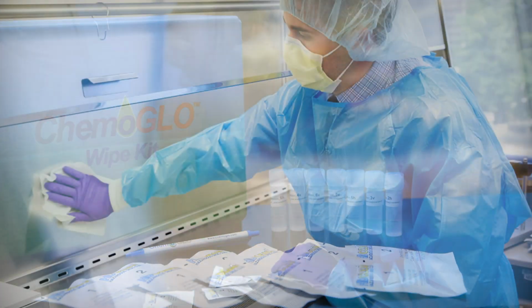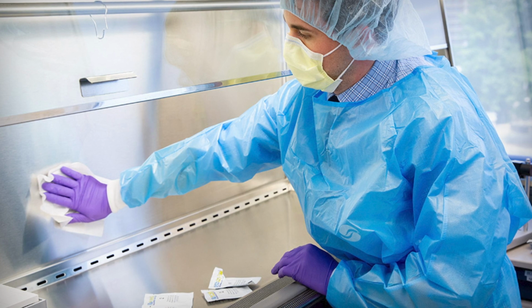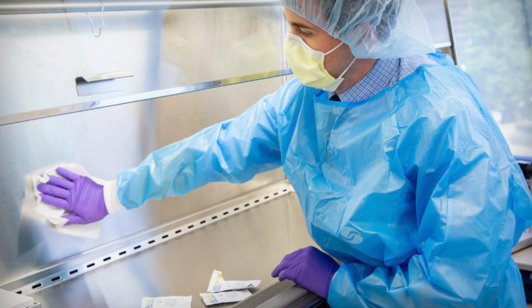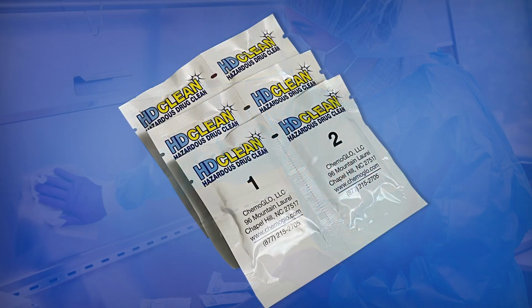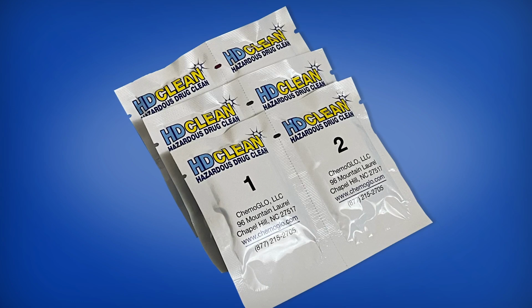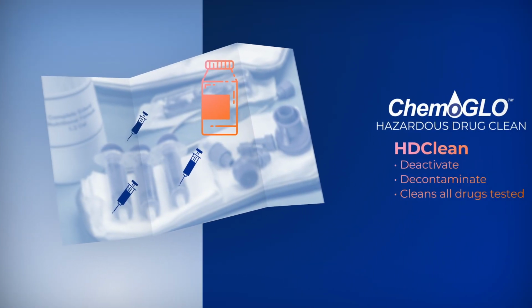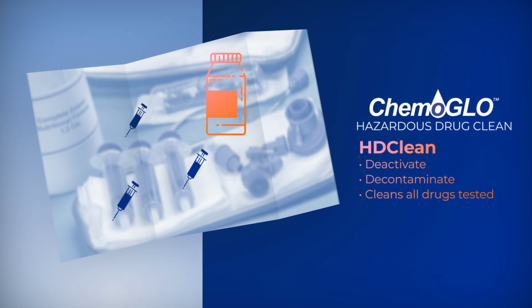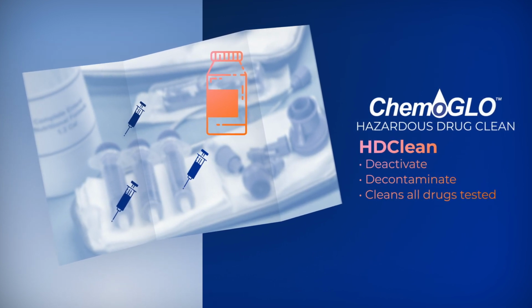And so since we had the ability to detect all these different drugs, we could test different solutions, different towelette materials to optimize that so that we could clean a wide variety of hazardous drugs from surfaces, and every surface we looked at. And so what we found was that hazardous drug clean, or HDClean, was able to decontaminate or fully remove a whole series of hazardous drugs from surfaces.